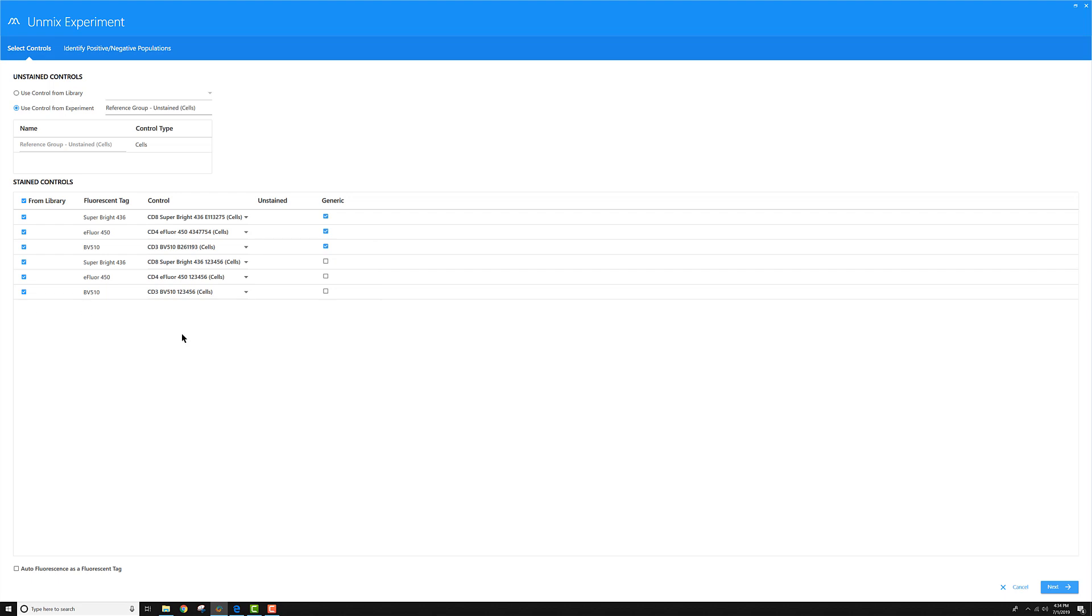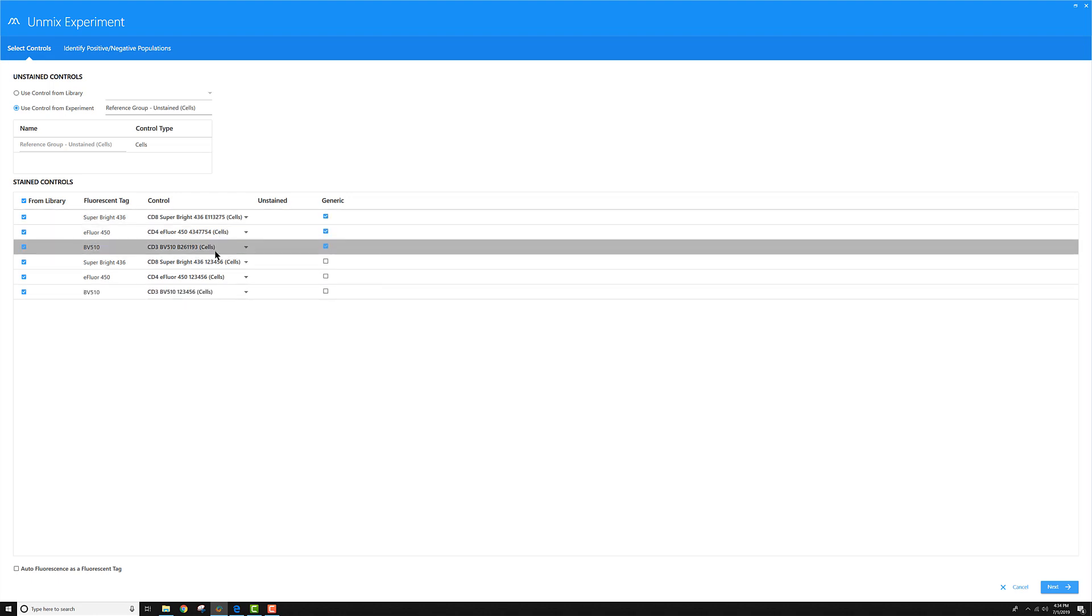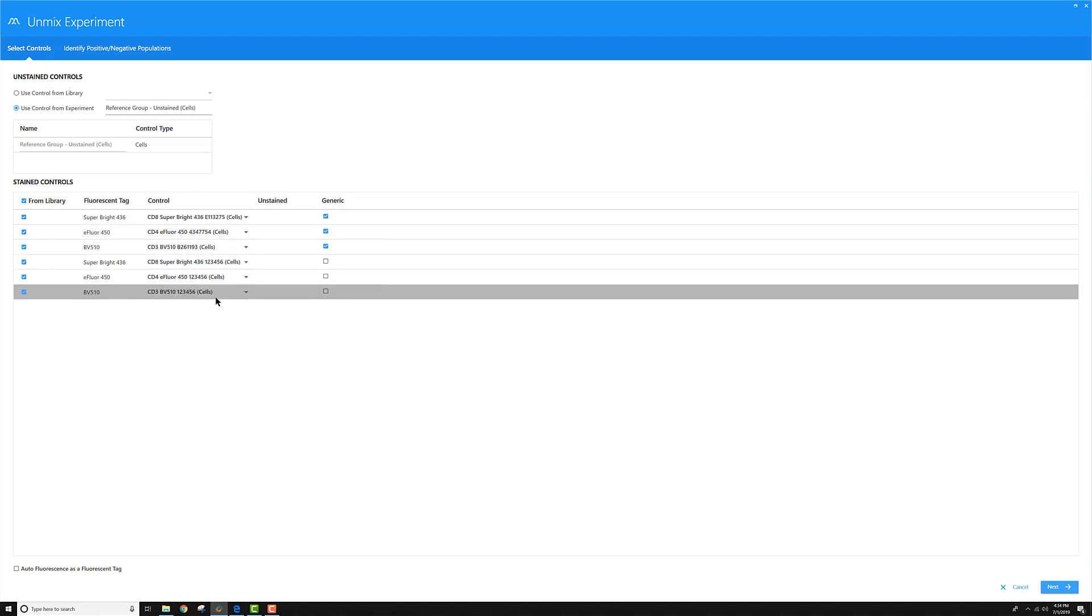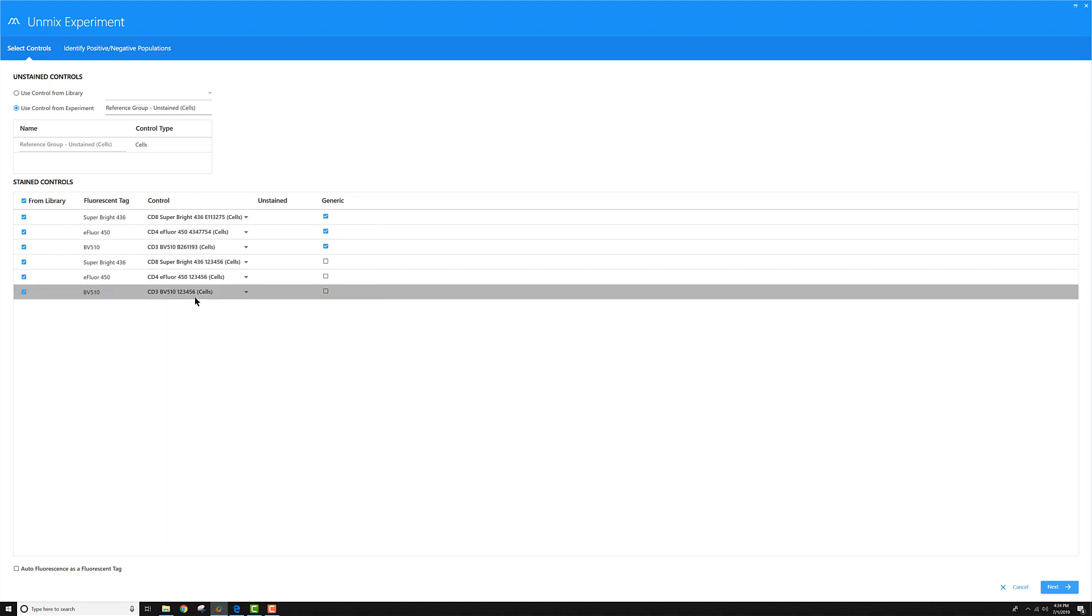It's going to need all six of these controls in order to unmix my two tubes. Why? Because I specified different lots for each of those multicolor tubes.